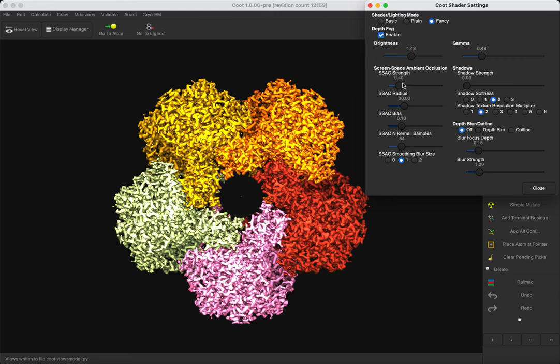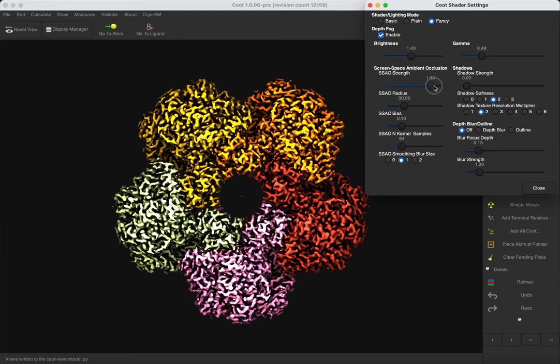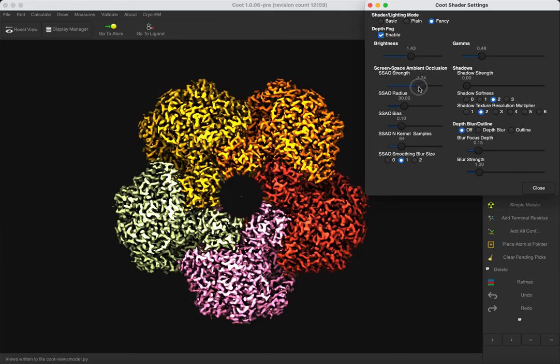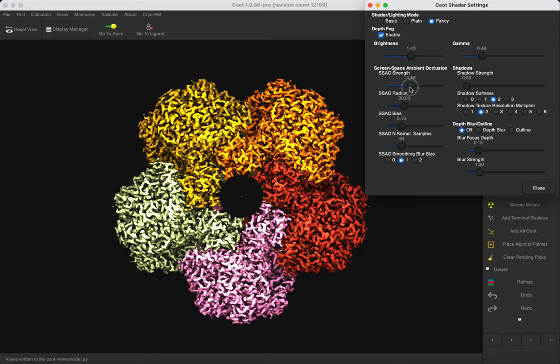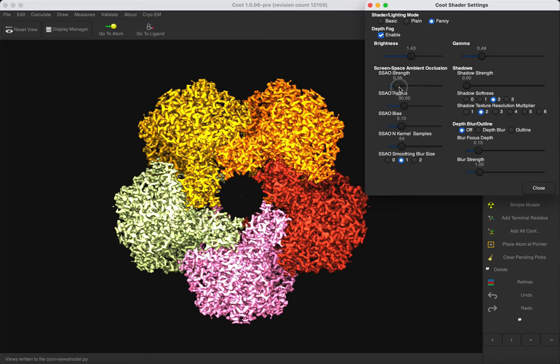We can also use the Screen Space Ambient Occlusion. The Ambient Occlusion approximates the shadow when the object is uniformly lit. They do a good job by highlighting, for example, internal cavities.